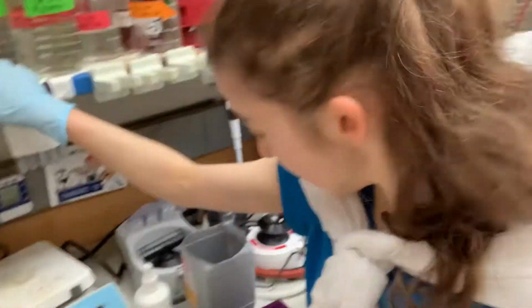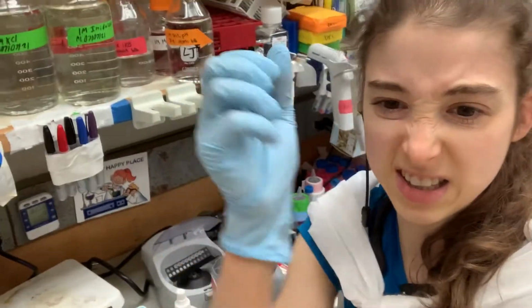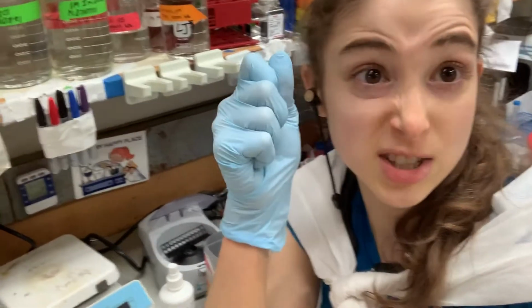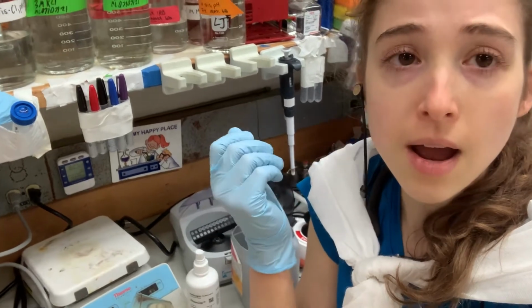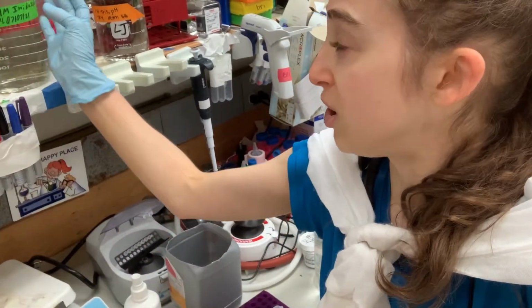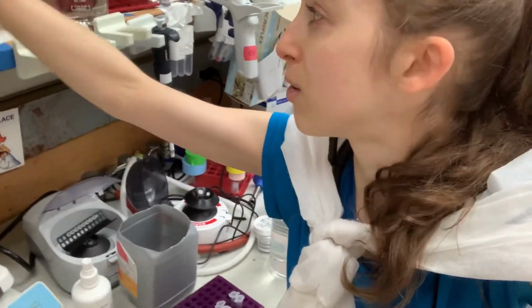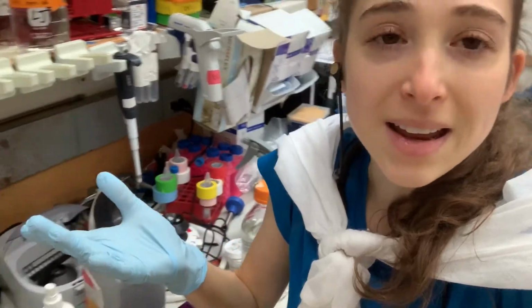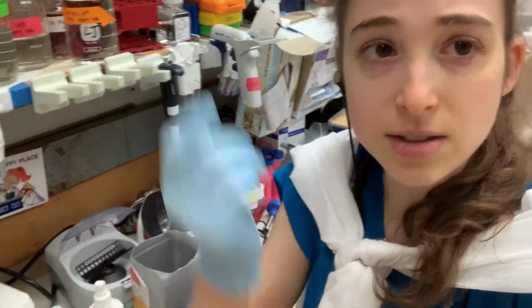So just like Starbucks has its syrups that it mixes into its coffee, you wouldn't want just the syrup by itself, right? That would be super sweet. So we wouldn't want to actually use a salt at 3 molar or 5 molar NaCl. We wouldn't want to do that, but we would want to dilute it into our solution. So just like adding the syrup to the coffee.